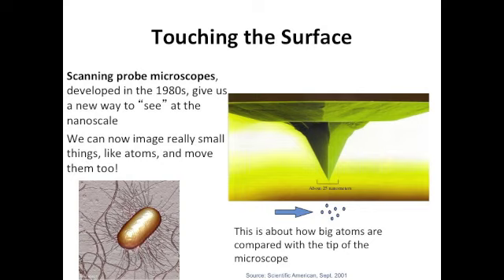This teeny tiny tip moves up and down in response to the electromagnetic forces between the atoms on the surface and the tip that's measuring it. You can see this really cool image of an E. coli with the pili and the flagella that's been taken with an AFM.